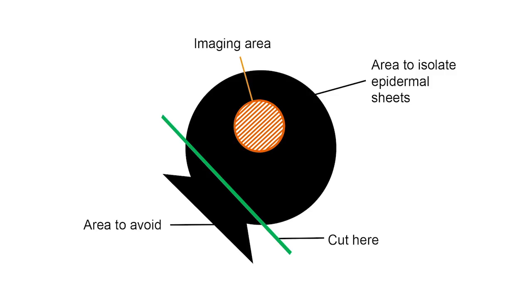Ideally, care should be taken during tissue collection to avoid the region where the ear joins the scalp. This area contains a lot of fatty tissue that can make the peeling more difficult. Only the area circled will be used for imaging after the epidermal sheets are stained.